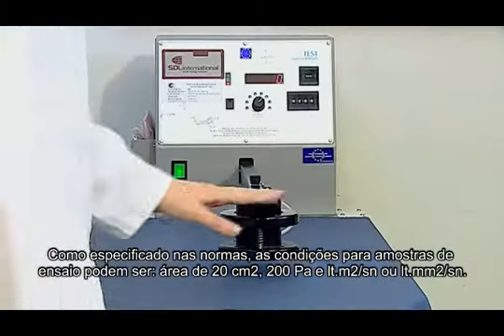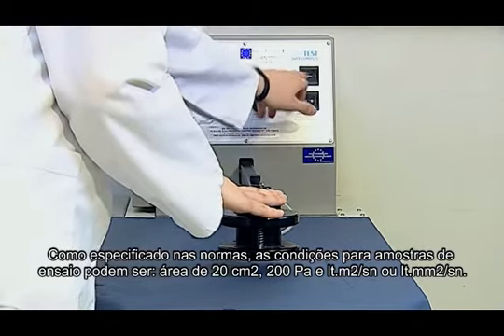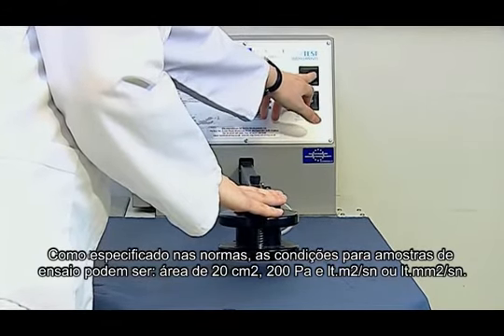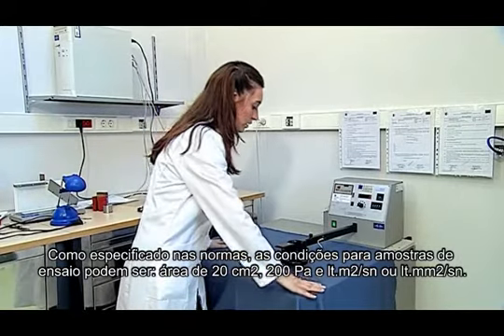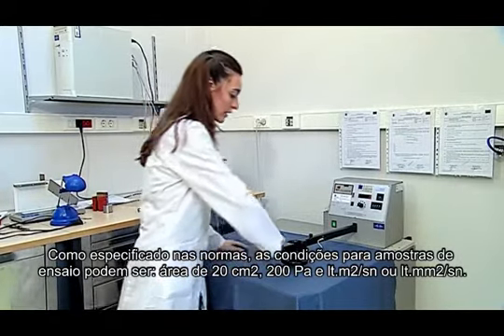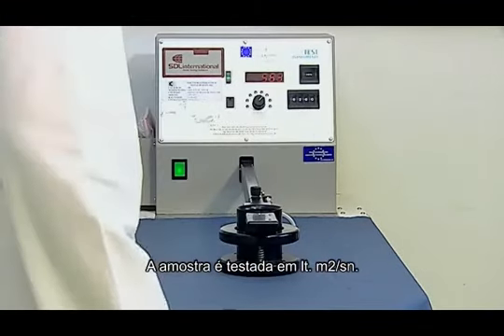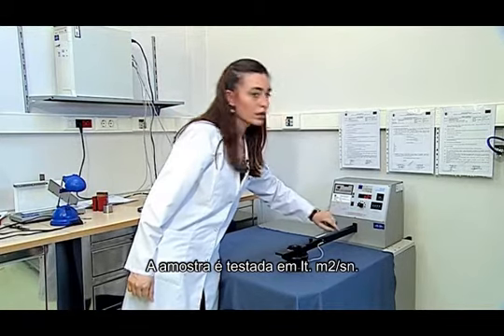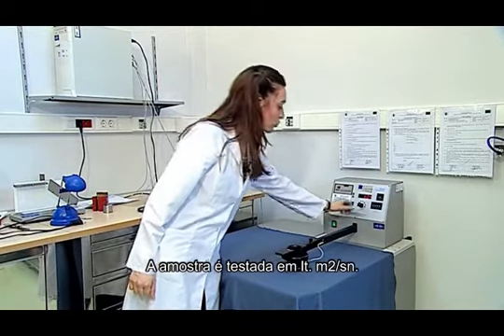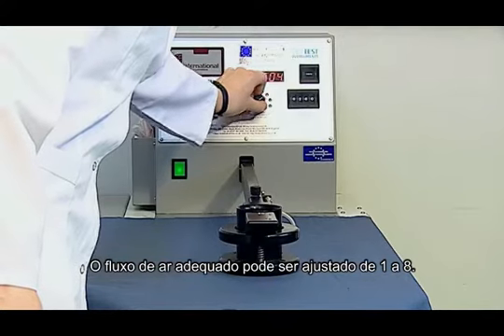As specified in standards, the conditions for test specimens can be 20 square centimeters area, 200 pascals, and how many liters pass through a square meter per second, or how many liters pass through a square millimeter per second. Now, we examine how many liters pass through a square meter per second. We test the sample in this way. Likewise, we choose the appropriate airflow from 1 to 8.